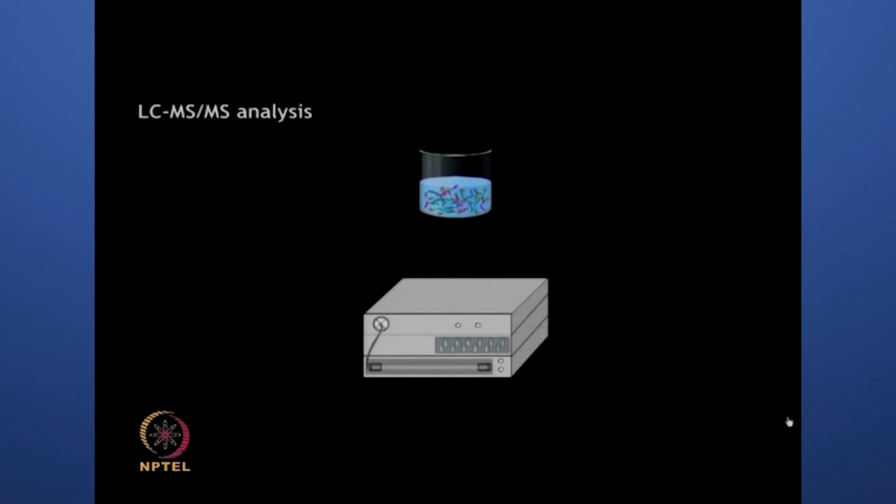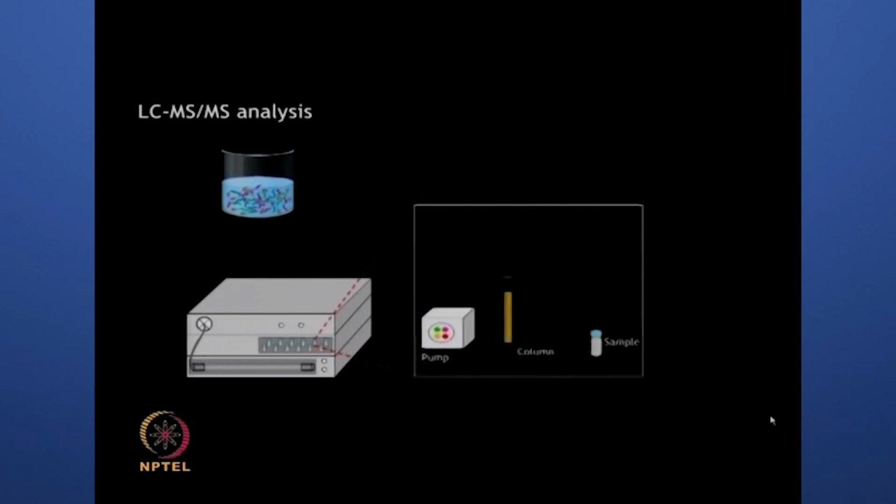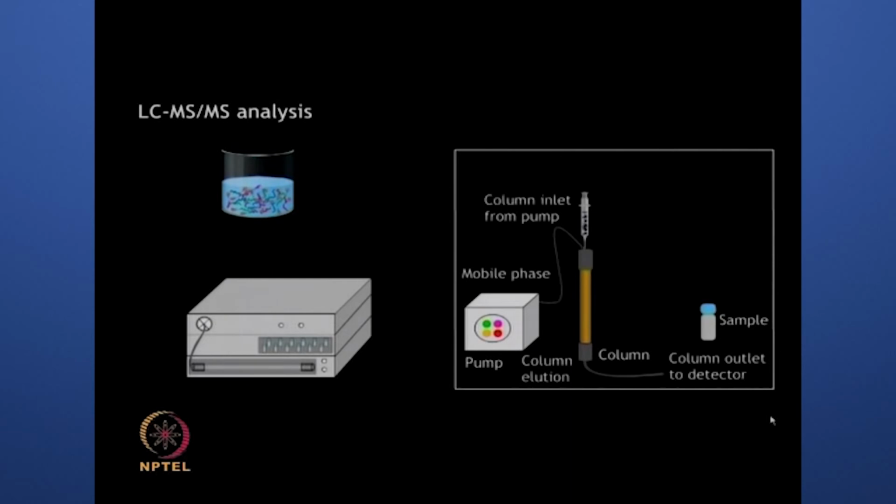Further purification of strong cation exchange purified samples is carried out by reverse phase liquid chromatography, wherein the sample is passed through a column containing a packed stationary phase matrix that selectively adsorbs only certain analyte samples. The eluted fractions are further characterized by MS.